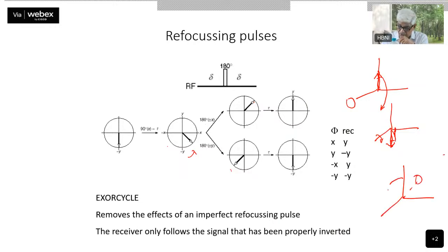The magnetization rotates here. Okay, so it will come up till here. So it will come here. So therefore, it will now generate a component. This component remains the same because it is also 170 degree, but it will have a component here.